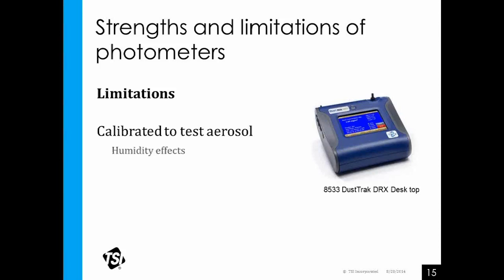So we've seen studies that in some atmospheres, some aerosols are hygroscopic, and when humidity levels get to 50 to 60%, they're going to grow, they're going to swell. So picture a sponge in the sink where you're washing dishes. That sponge is full of water.